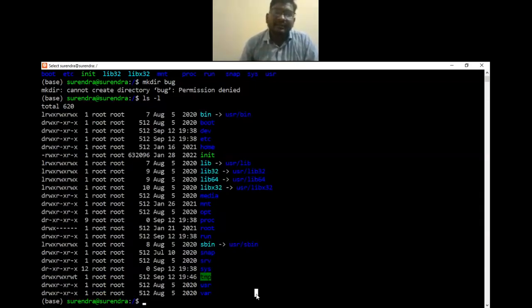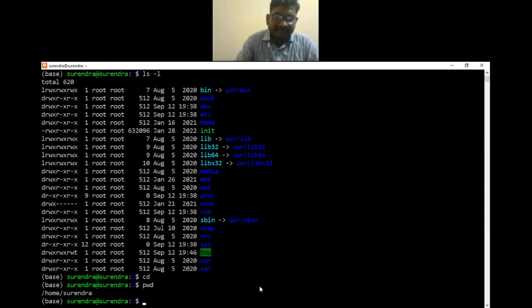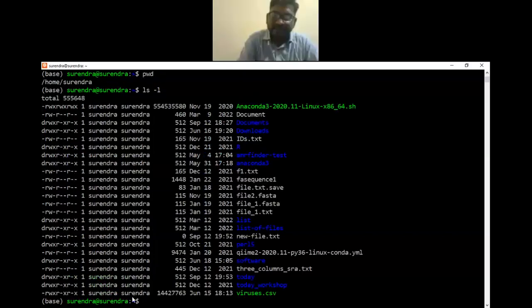Do you get this? Yeah. Sir, so I am the owner only inside the home Surendra user directory folder. Yes, I'm the owner of this location only. I have limited permissions. The other user, suppose my friend also has an account here, has a directory in the home, like here.